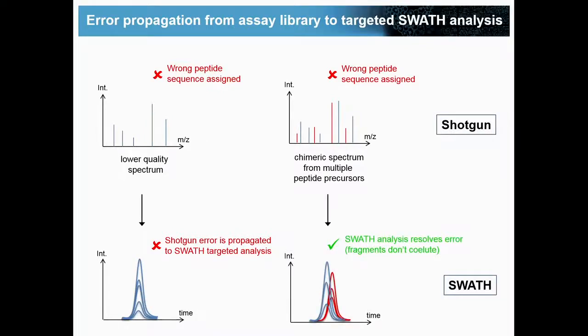Well, what will probably happen there is that you will extract 2 signal groups, right? Because it's likely that these 2 peptides won't exactly co-elute. Or they might, but it's more likely that they won't. And then these will get scored badly, because one of the things that we said is important is that all the fragment ions should co-elute in this peak group, and if they don't, then the algorithms will score this very badly. So in this case, the error gets kind of resolved. Nevertheless, we don't really know the prevalence of these types of problems, one or the other.